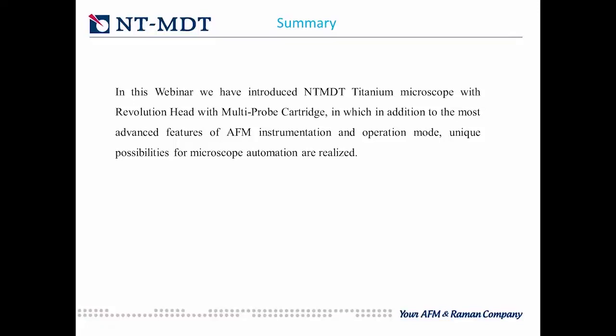But for what we do so far, in the frame of the modes, in the frame of our characterization of the tip, which includes measurements of the radius and stiffness of the probe, in this particular model, if you trust all these three measurements, then there can even be absolute measurements for these particular conditions. Okay, it's okay. Thank you.